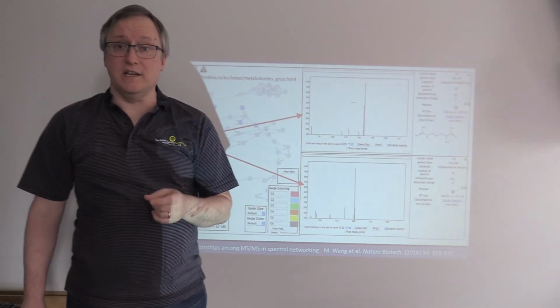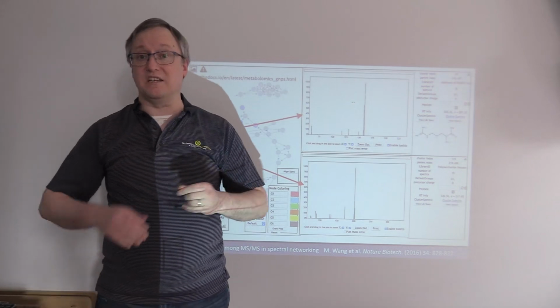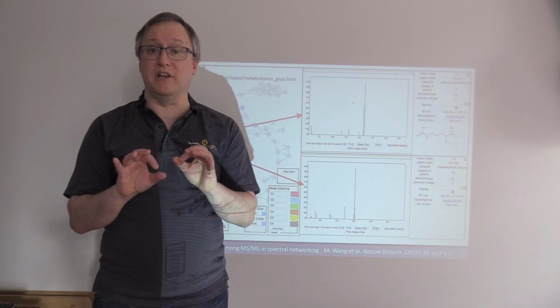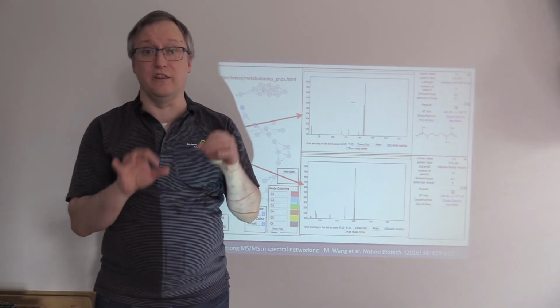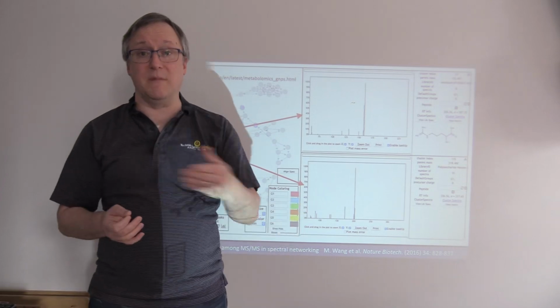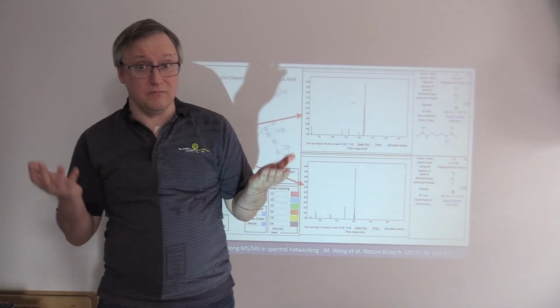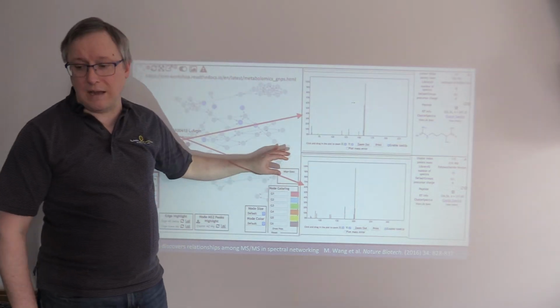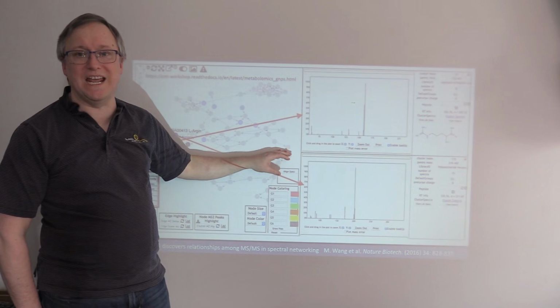The reality is that if you're dealing with something as messy as plant metabolites, it's quite likely that some of the metabolites you'd like to measure are not in the reference library. If they're not in the spectrum library and you can't match them by, say, a hybrid search, it's going to just go unidentified. So in this case, I'm showing a result from GNPS.